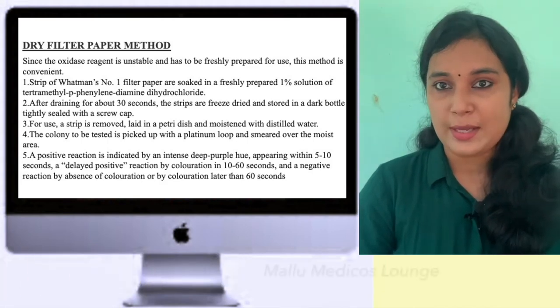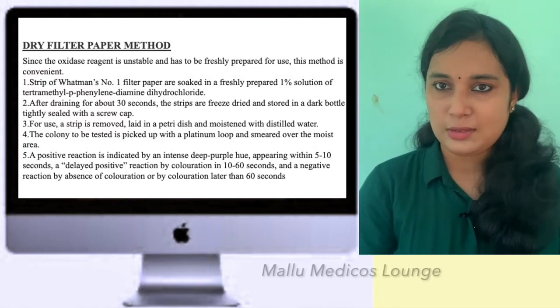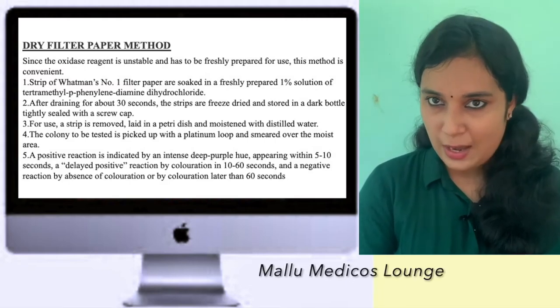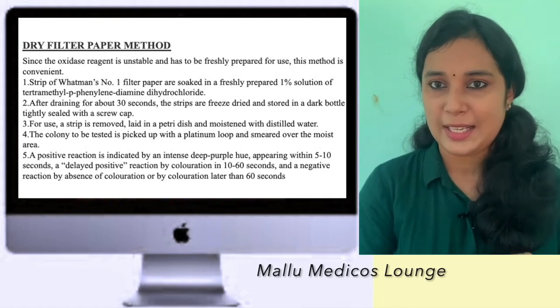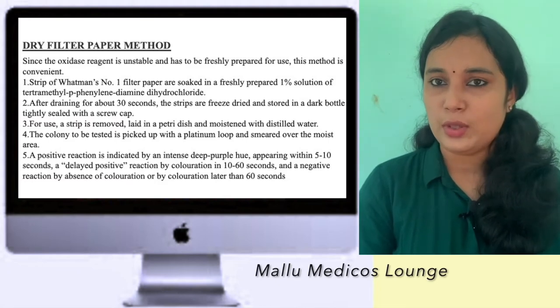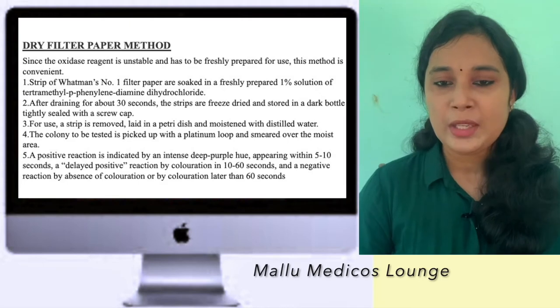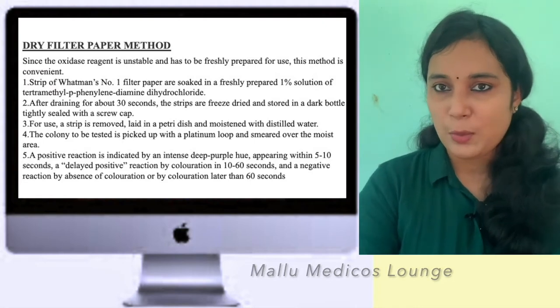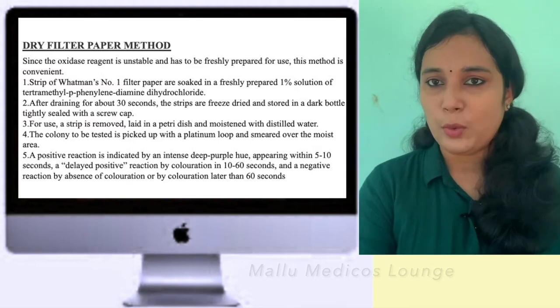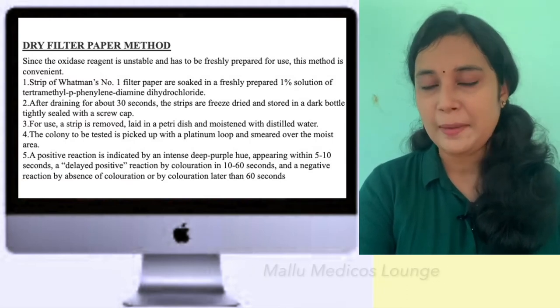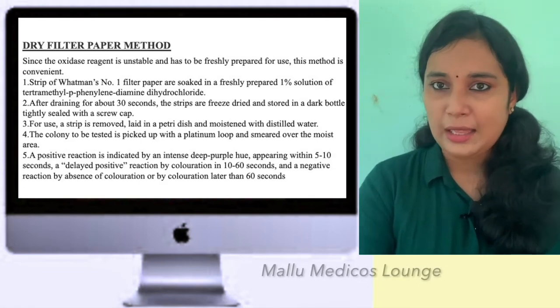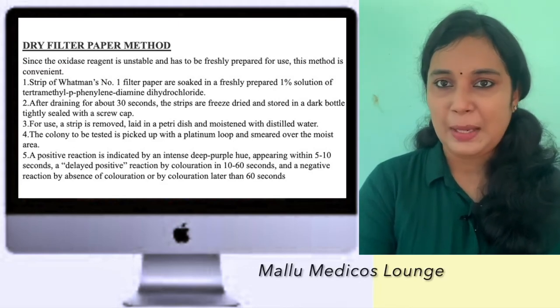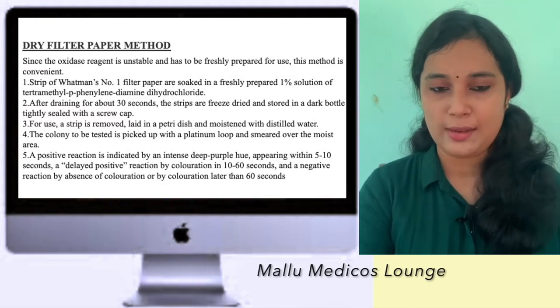We cut strips of filter paper and saturate them with freshly prepared oxidase reagent. These saturated strips are then dried and stored in dark bottles in the refrigerator. To test, we take a colony from the culture plate using a sterile wooden applicator stick and rub it onto the filter paper strip.